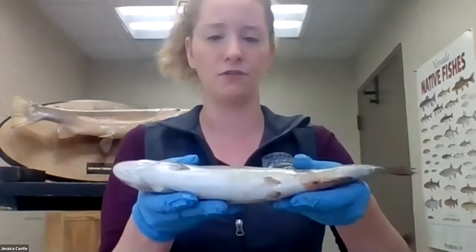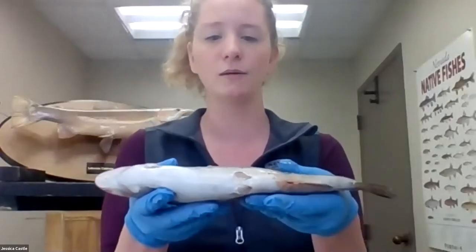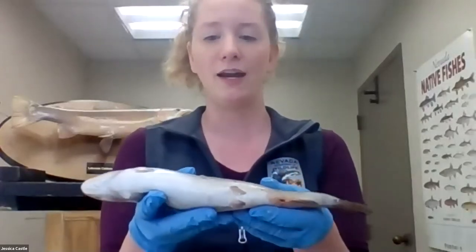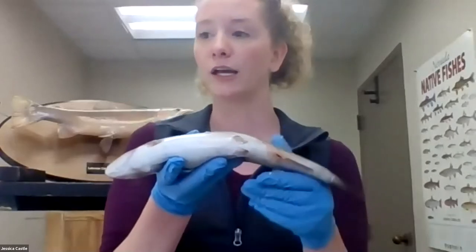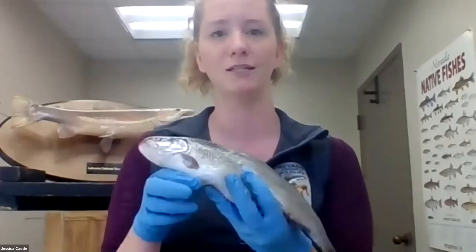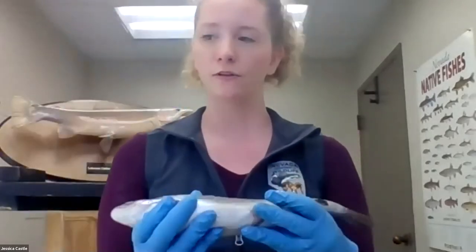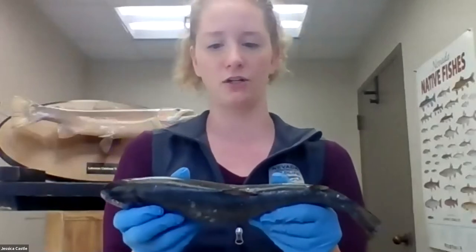If we look at the bottom of the trout, you can see it's pretty light colored — very light compared to the top. And that is, again, if a predator is underneath the trout looking up at it, it won't be able to see it very well because it's going to blend in with sunlight coming down on the water. So those are both forms of camouflage that our trout has.